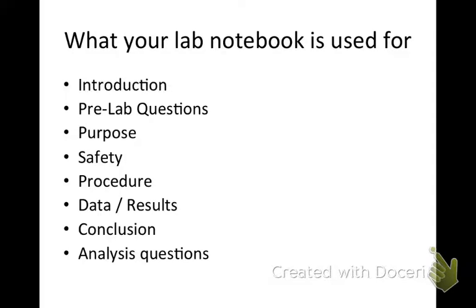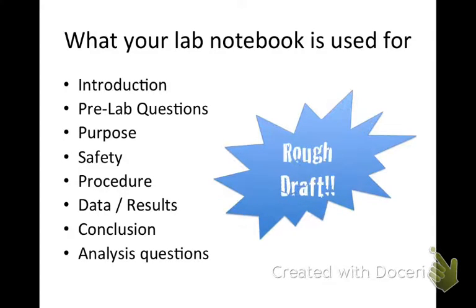Your lab notebook is also kind of like your rough draft, so don't worry if you have to cross something off or if it's not written perfectly, all right? So I want to make sure that you realize that your lab notebook is for someone to be able to look at, see what your information was or what your data results were, and kind of get an idea of what it looks like. I'm going to be grading your lab notebook, but I will be giving you certain criteria. So, if you cross off something or if it looks a little messy, it's okay. As long as I can read it, it's fine.